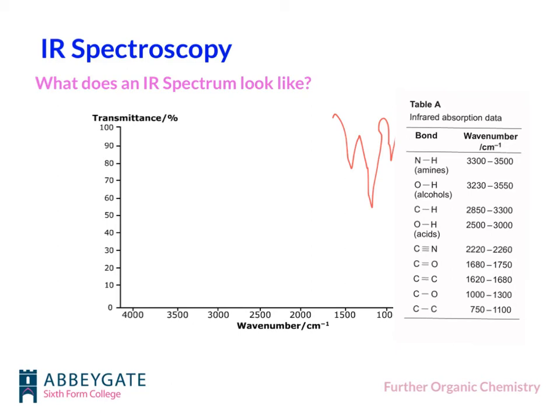If you had something with an aldehyde or a ketone, so it had a carbonyl carbon, I'd expect to see a really sharp peak around 1,700. Okay, these will make more sense when we look at other things. So if I had a sharp peak around 1,700, and I also had a broad peak over here, my drawing is nowhere near as good as an actual spectrum, then you'd see, oh, I've got a broad peak around 3,200, 3,000.